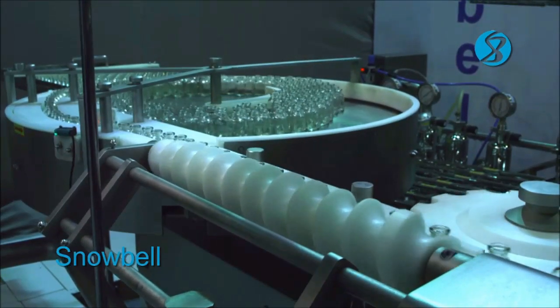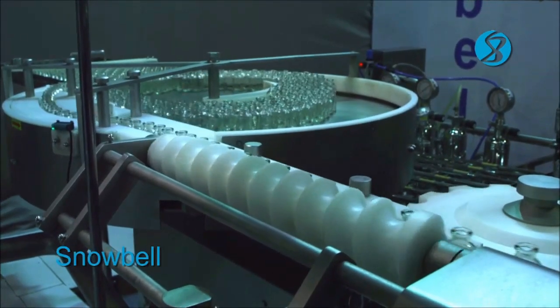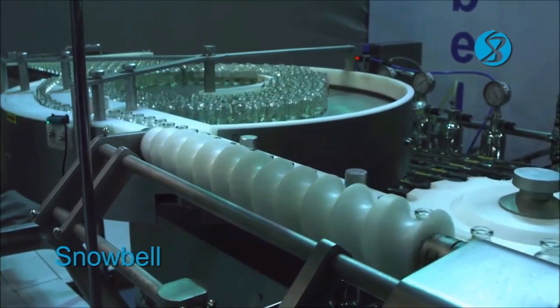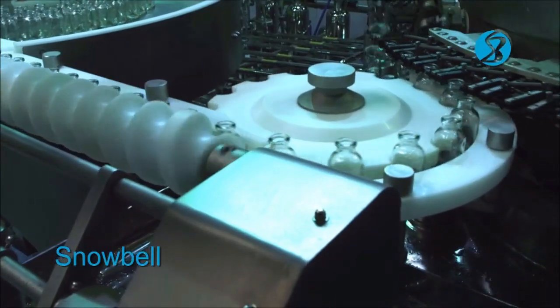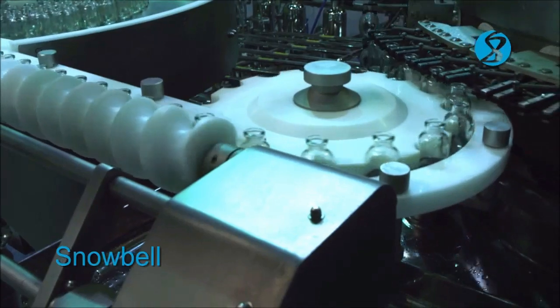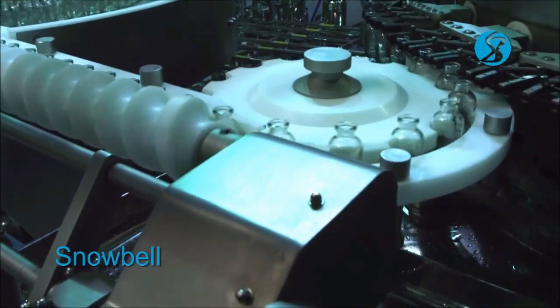The vials, singled out, are then transferred to the in-feed star wheel and delivered to a revolving conveying system consisting of 60 equally spaced V-grippers mounted on its circumference.